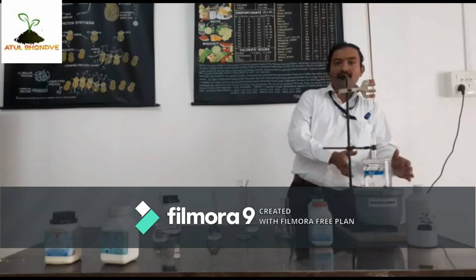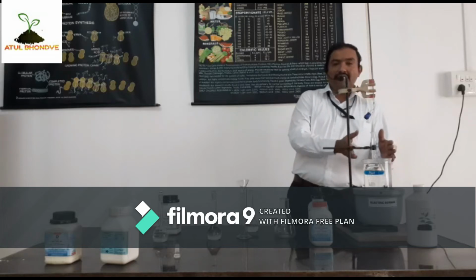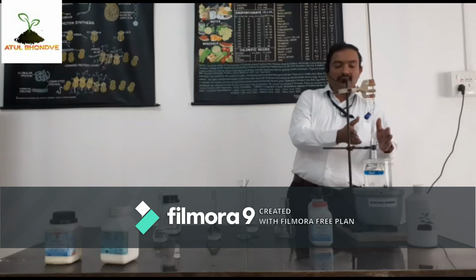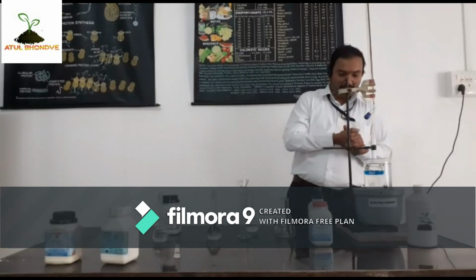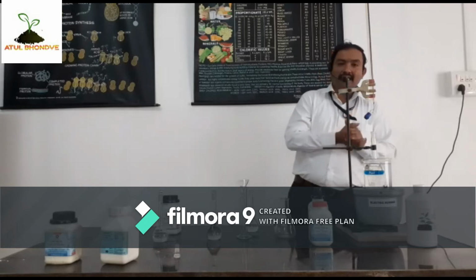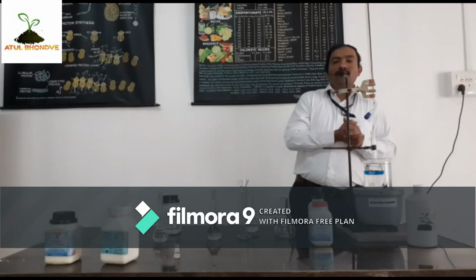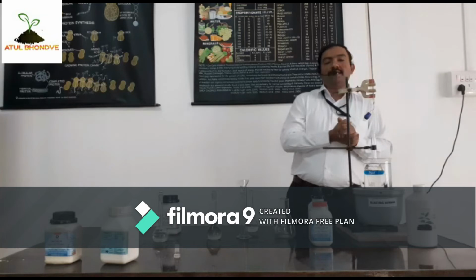For heating purposes and for the practical, we used the burner and the water is heated here, and we placed the volumetric flask containing Benedict's reagent, and we placed the burette containing standard glucose solution. Drop by drop addition of glucose into the Benedict's reagent started here, and when the complete blue color of Benedict's reagent disappears and a white precipitate forms, it indicates the titration is complete.